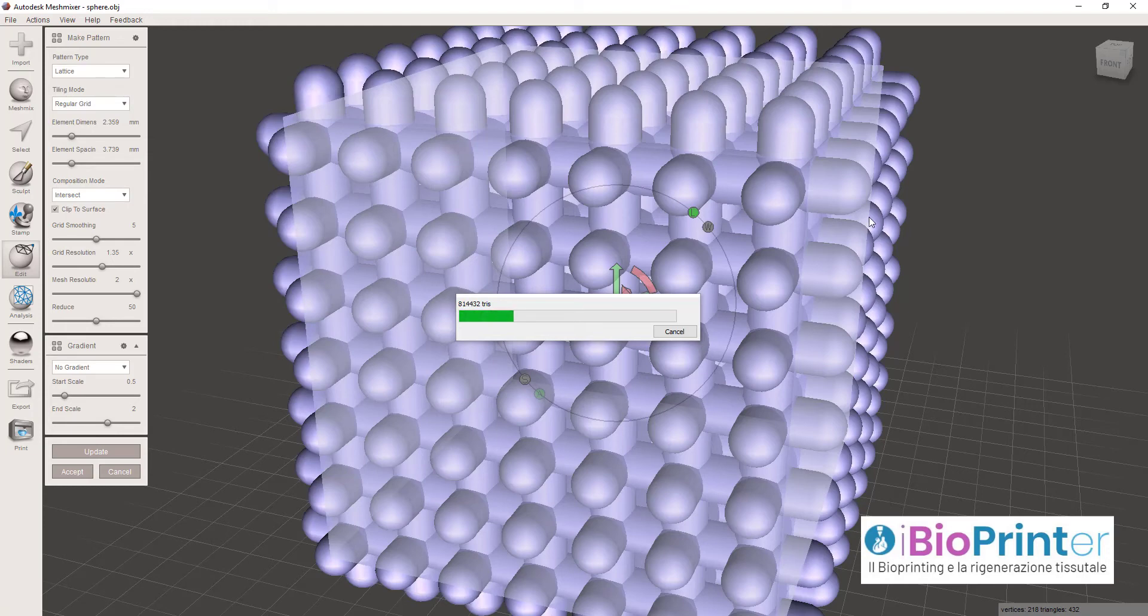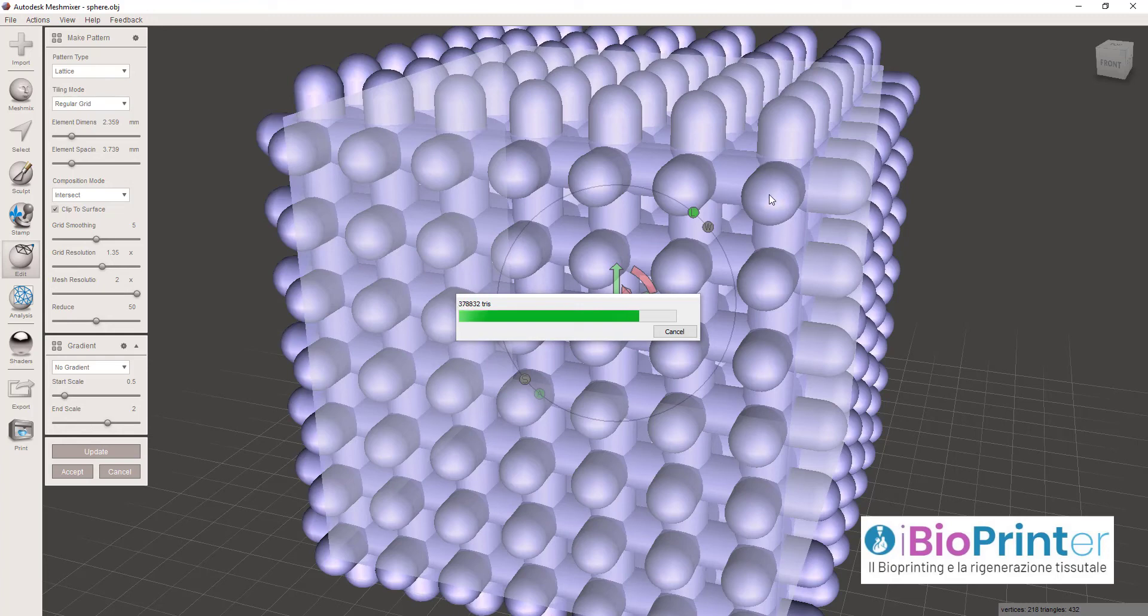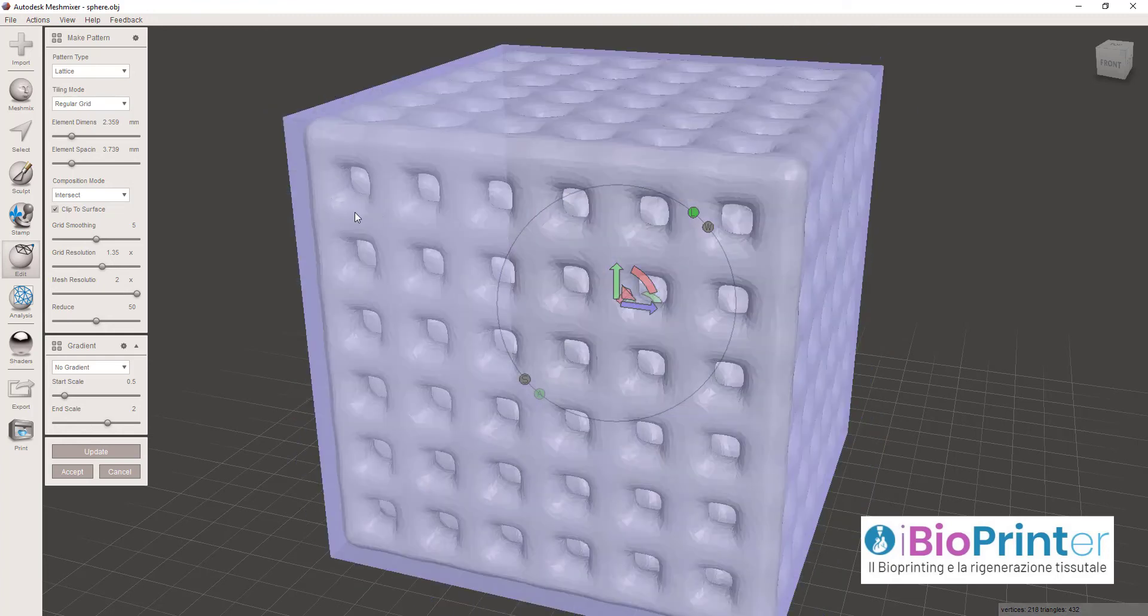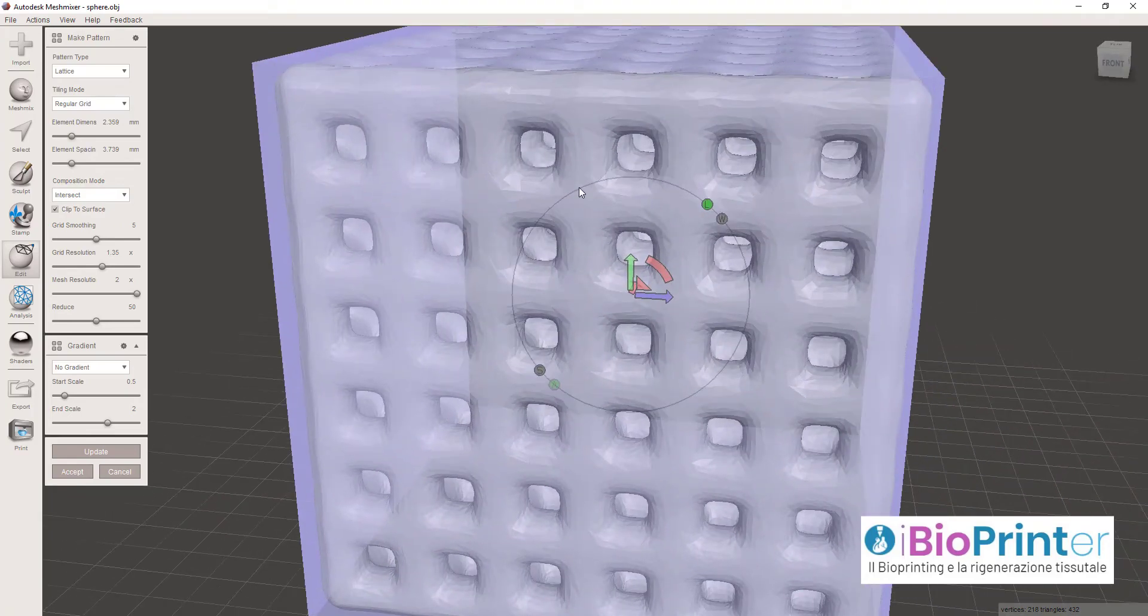Ovviamente più queste sfaccettature diminuiscono e più pesa in termini di megabyte il file che andremo a salvare in formato STL per poterlo poi stampare con le nostre bioprinters. Il formato STL è lo standard per la produzione additiva.